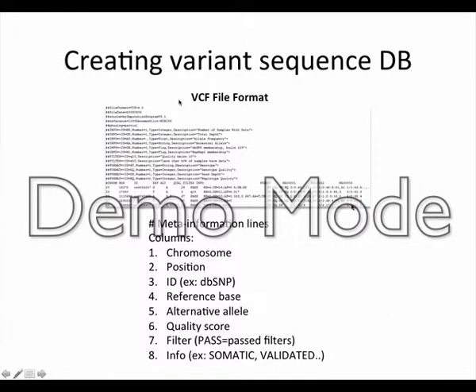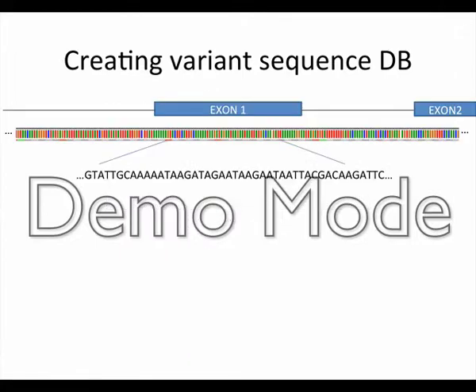So how do we do that? I don't know if you guys have used a VCF file. This is the output of genomic analysis looking specifically for SNVs and other indels, etc. But let's just focus on the SNVs. So we essentially extract from this the chromosome and the position, and the new nucleotide that it's changed to, right? So we use that information.